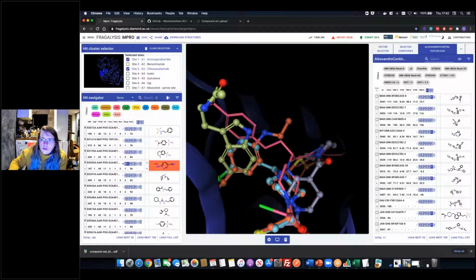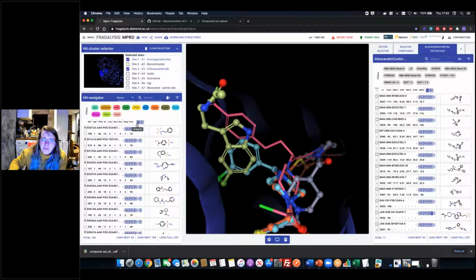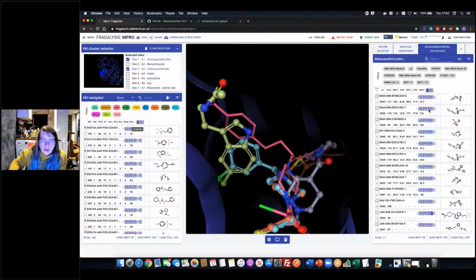So I turn all of them off and all of them off. Let's not turn all of them off. Just get them off. Maybe clear that side. It's failing to be responsive, which is excellent. Love it when it happens. Just give me a second, I'll reload and get back to where we were.